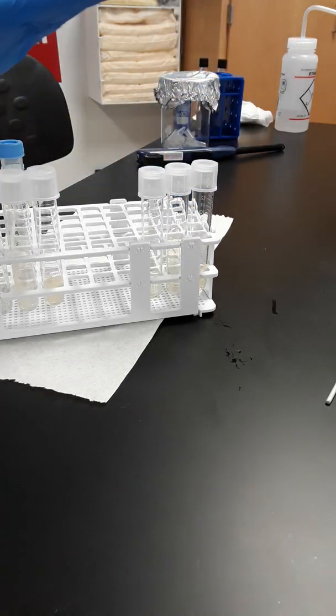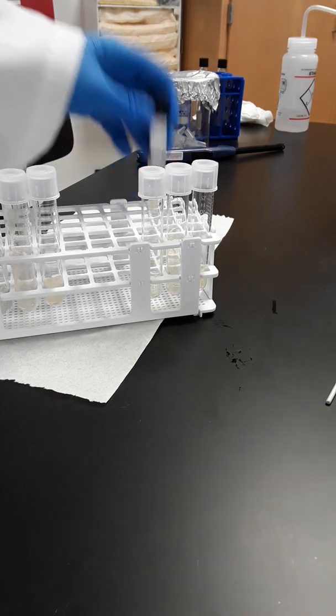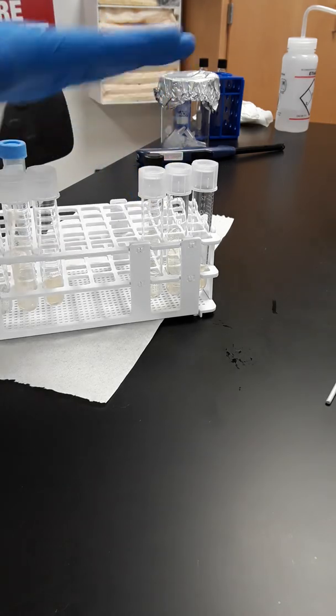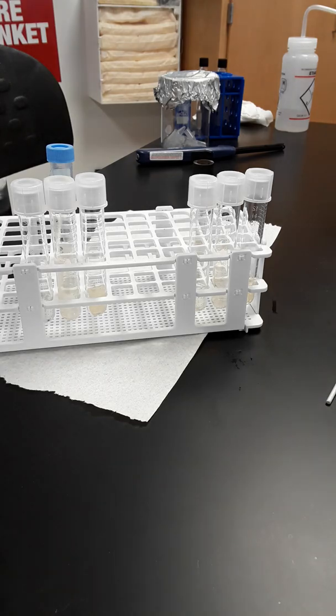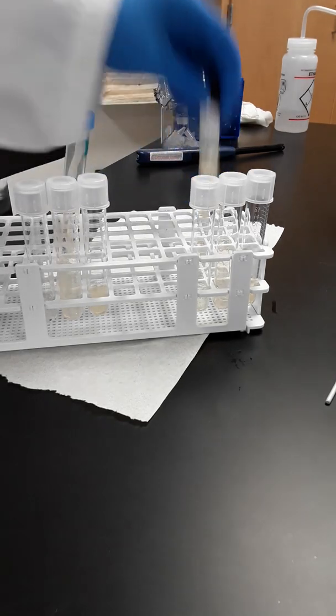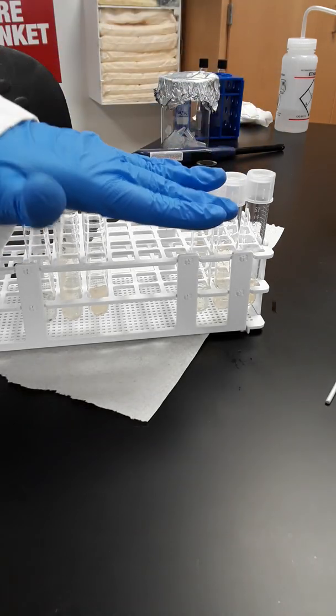And the moral of this story is that it doesn't matter if your culture originated from solid or from liquid, we're going to see the same results. And that's because the cultures that we have are the same. So it's still a cell here, it's still a cell here. They're going to have similar properties no matter where it originates from and where it goes to.